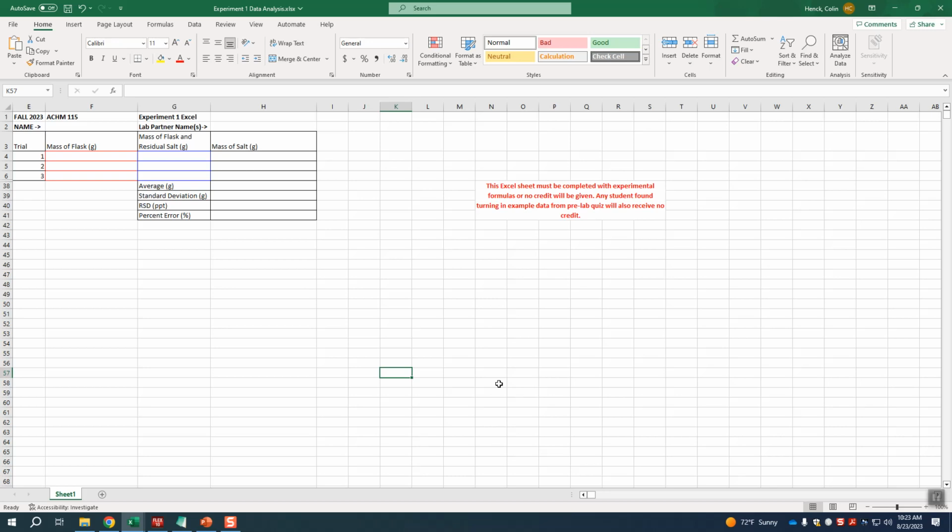You've probably gotten most of that from the quiz questions, and I probably should have said that before I went over the quiz. That being said, what you're going to have is 2 masses for each trial. So there are 3 trials, and you're going to have 2 masses: the mass of the empty flask before you put the salt water in it, and then the mass of the residual salt in the flask.